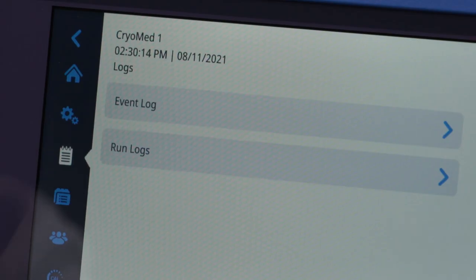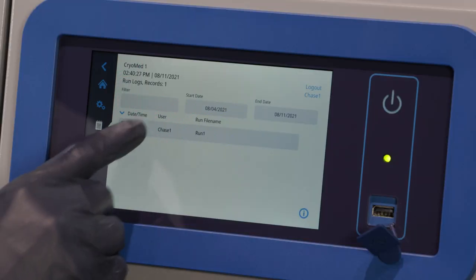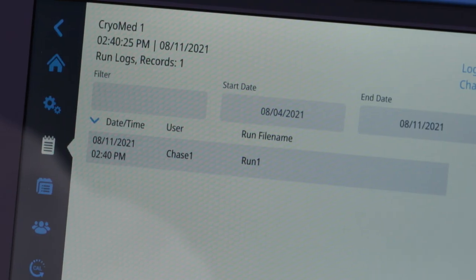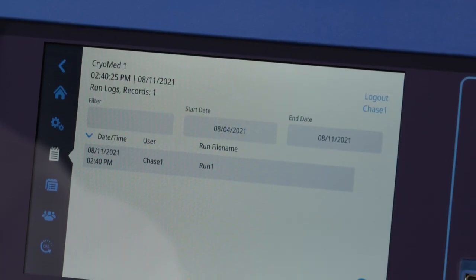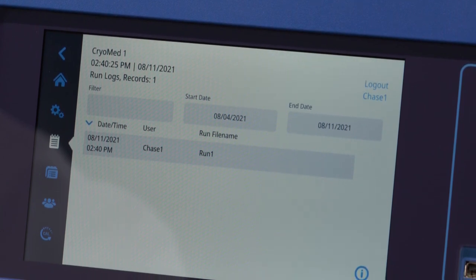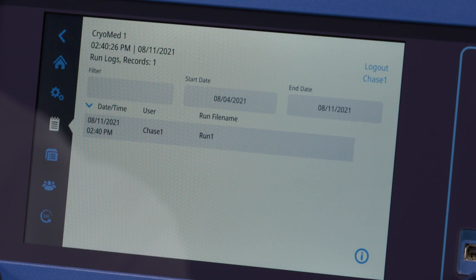In the Run Logs, you'll find a collection of all profiles that have been run on the unit. When you select the Run Logs button, a list of the most recent runs are visible. Press on a run list entry to review the run information. You can sort the list by pressing on date, time, user, or run file name in the header row. Filter allows free text to be entered, and the list will filter wherever the occurrence of that word occurs. Up to three comma-separated text entries may be entered. Note that custom fields and field names are also part of the filter.